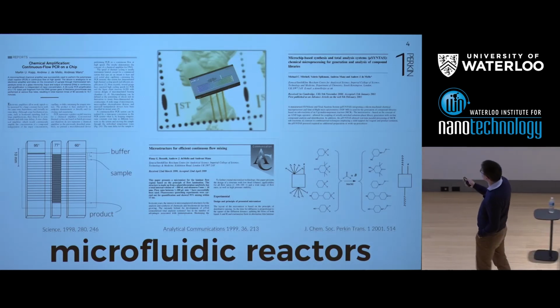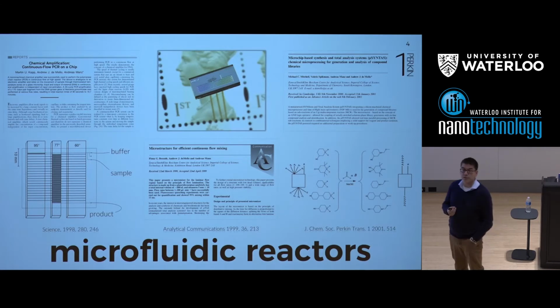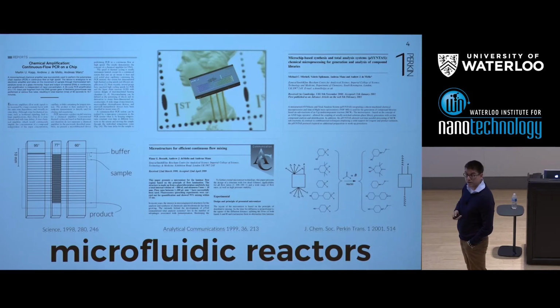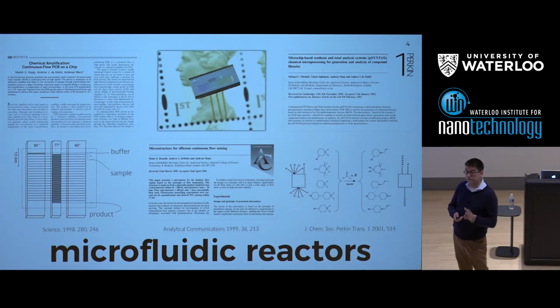You can see here an example from many years ago now, using this device to start to make small molecule compound libraries. The idea is that by using this device, we can perform rapid mass transfer in terms of mixing of our reagents. In this case, we were performing multi-component reactions.